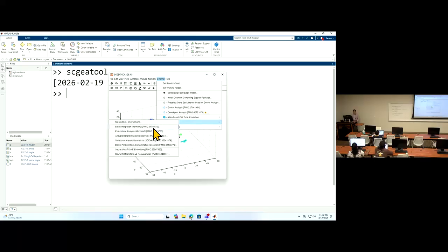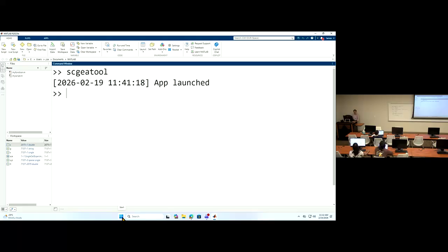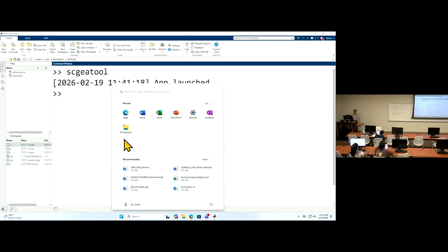When you click this button, the program knows where to save and call R. Those functions, for example the pseudotime analysis, we are not going to re-implement in MATLAB, so we rely on this external package. In order to run those R functions, you have to have R installed on your machine.